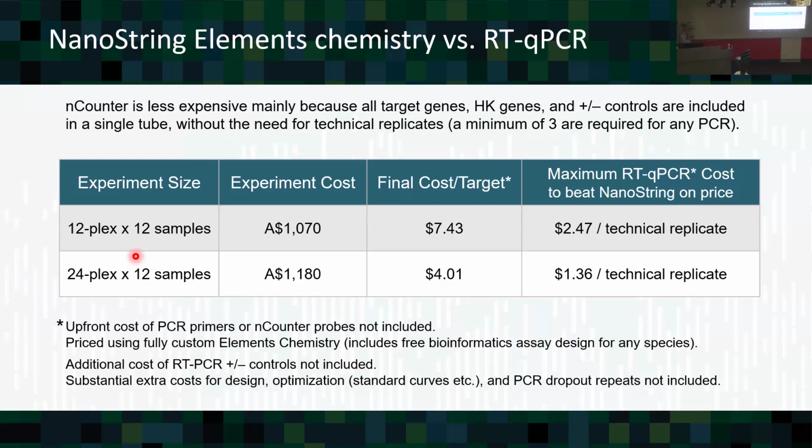Is the question about the chemistry of the probe itself? Yes. So there's locked nucleic acids. Oh, yes. Yeah, LNAs. Are you using those? No. Because I believe if we do use those on the nanoString, there's the prospect of developing an assay where you implement 12 primer pairs, which are locked nucleic acids, that could potentially amplify hundreds of molecules. And you turn it into a generic product that makes it a bit more appealing for someone like me that's using it on many different species, each species at a time.